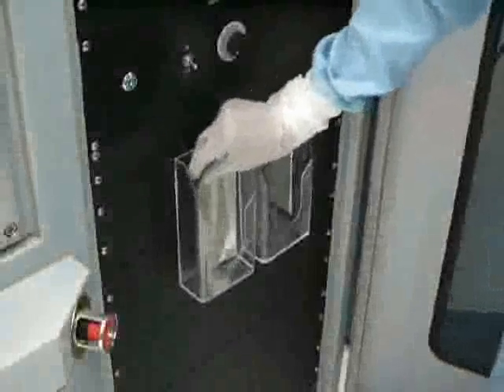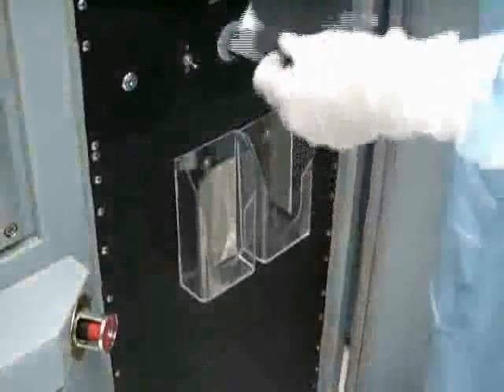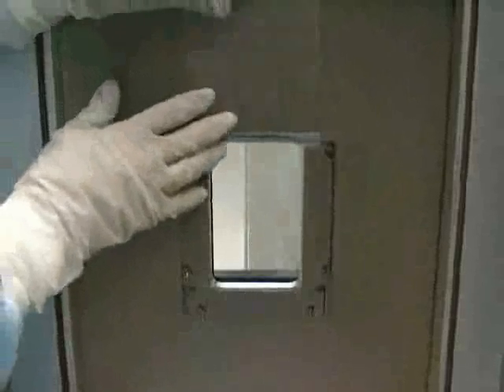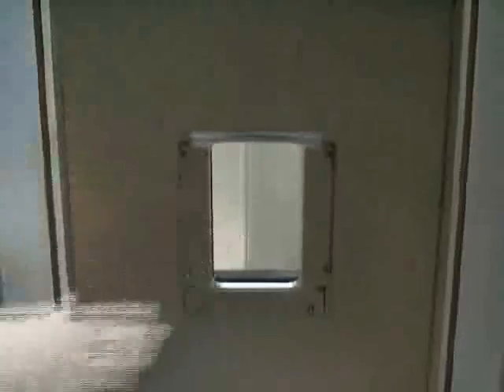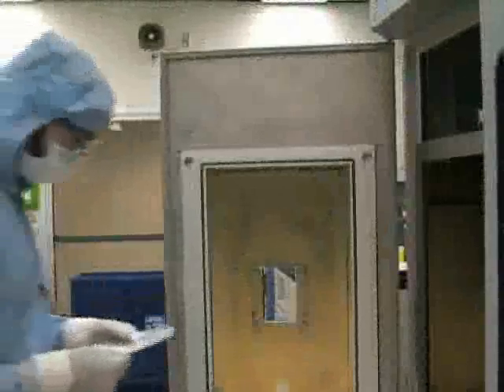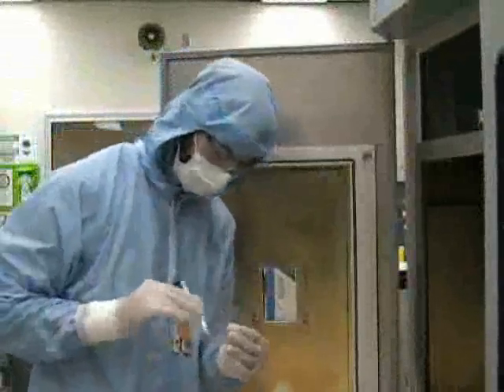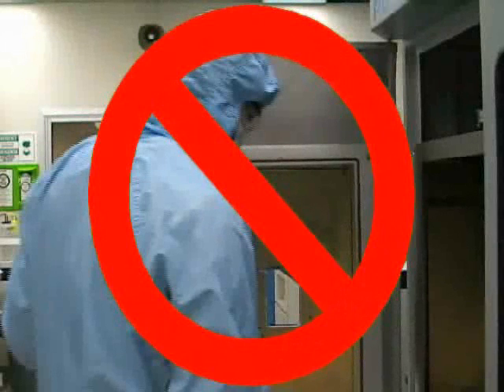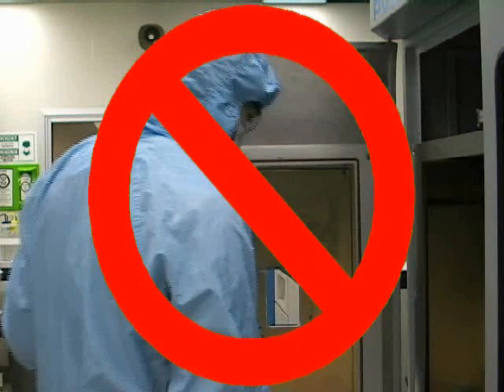Before you begin to pump the system down, you should place a new, clean mylar film in the holder over the viewing window on the inside of the chamber door. The mylar films are located on the front of the system. Do not run a process on the PVD without using a mylar film. The mylar film protects the viewing window from being coated with evaporated metal. The viewing window will be unusable if it happens to be coated.